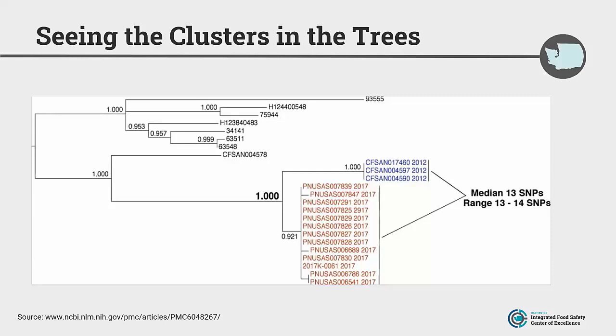And you can see, just looking at the SNP numbers, that might be something to look into. But also by looking at the shape of the tree, you can see that though they group together in one large clade, they split out pretty cleanly into 2 separate clades, where your facility isolates group together and your 2017 clinical isolates group together separately.